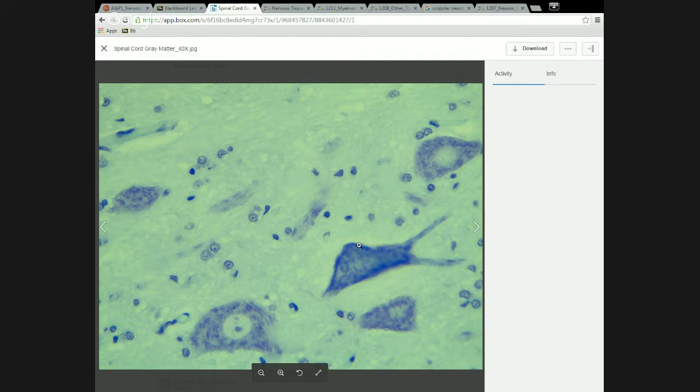The other cells here, you can't really see stuff coming off of them. And largely that's because the dendroplasm and axoplasm doesn't stain. But that doesn't mean that they don't have those things sticking off. In fact, they do. You will not be required in this course to identify a cell and say, is that unipolar, bipolar, or multipolar? Because the answer is going to always be very obvious.